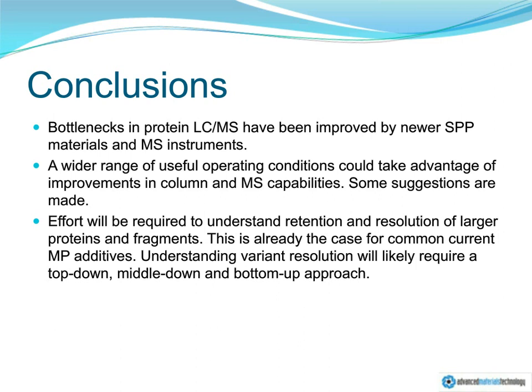In some cases, we're now getting sufficient resolution that we should proceed with caution to be very clear on what it is that we are resolving and what it means, because it's not always the case that an additional peak represents a unique and known protein structure. To resolve all of those structures, we will need to undertake considerably greater analysis.